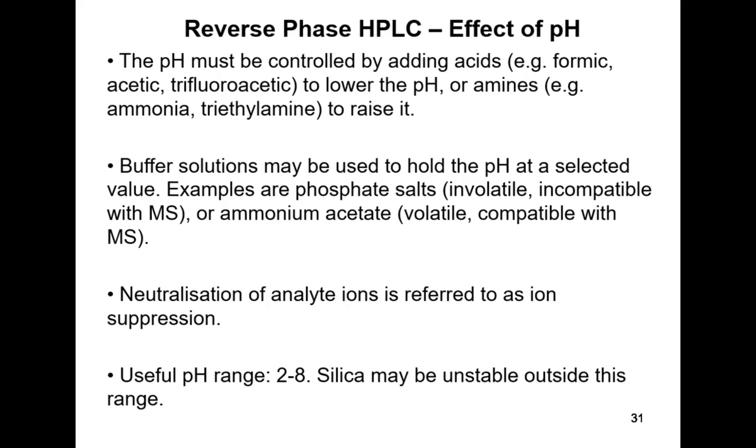It degrades the performance of the electrodes that are needed to keep mass spectrometry running. So it basically breaks your mass spec, and you have to open it up and clean out all of the salts.